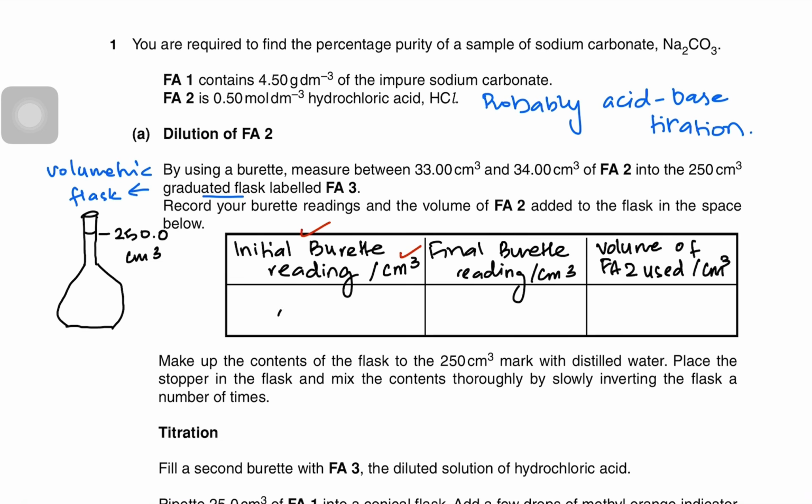Imagine that your burette was filled to a value of 0.10 centimeter cube. It's okay, you don't have to start from 0.00. And then by the end of the usage of burette, your value came to around 33.60 centimeter cube.